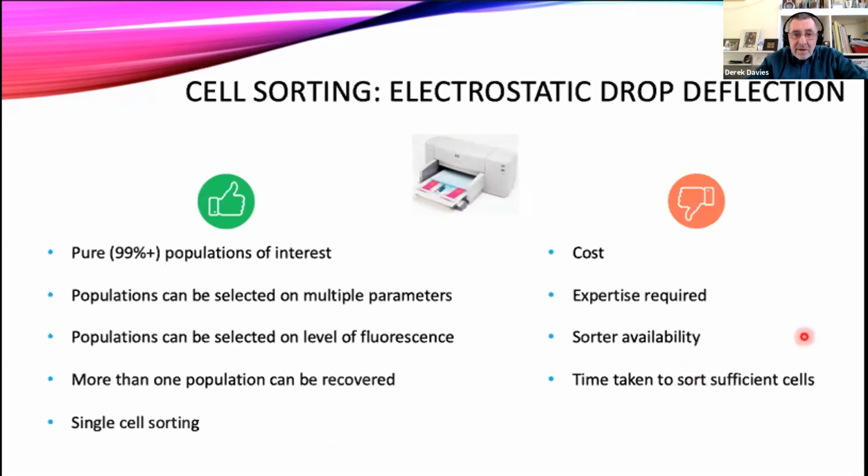Of course, there are a few downsides. Sorters are more expensive, both to buy, to maintain, and to buy time on as well. They do require a little bit more expertise. It's not impossible to train people to use a cell sorter. In fact, all of us here on this side of the call, at least, are big proponents, I think, of training end users to do the sorts if that's appropriate. But generally, it's people in the core facilities who are doing that measurement.